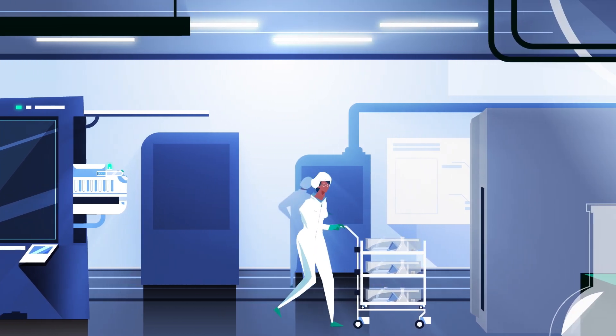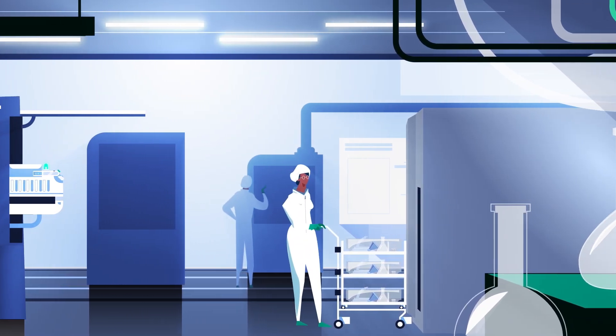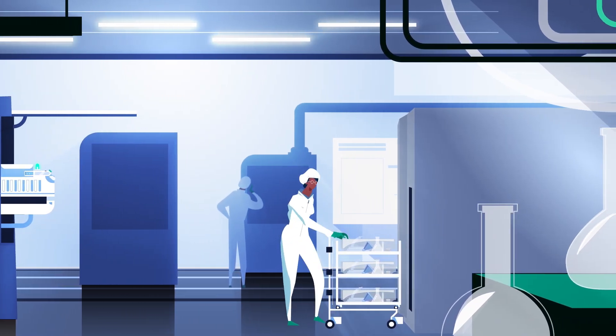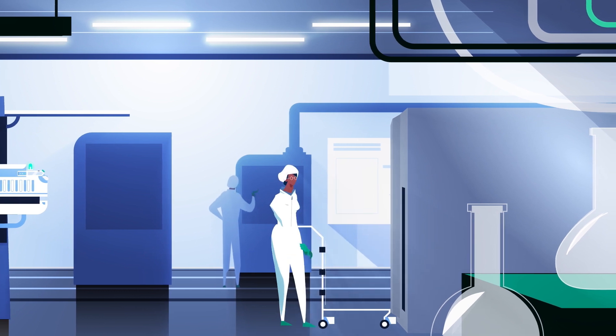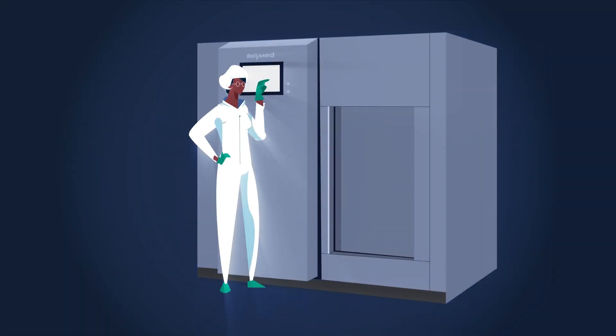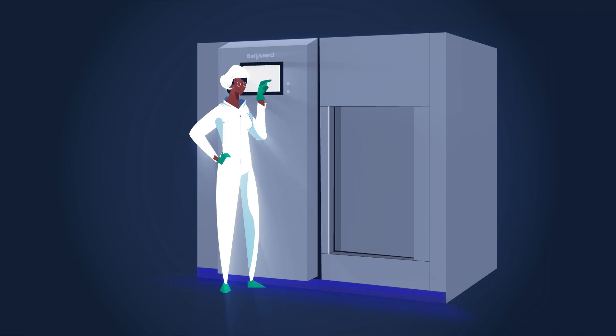The products are placed on the designated trolley, the trolley is pushed into the steam sterilizer, the door is closed, and the appropriate program is selected. And that's what happens next.